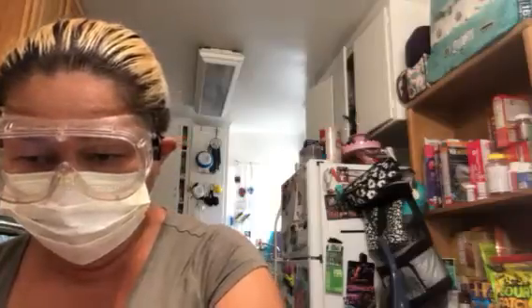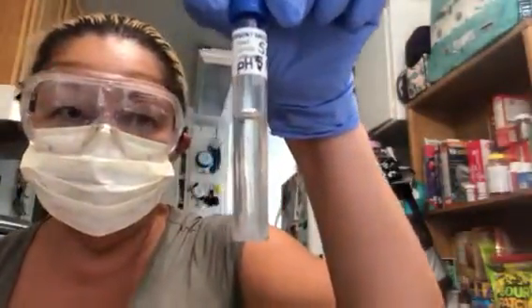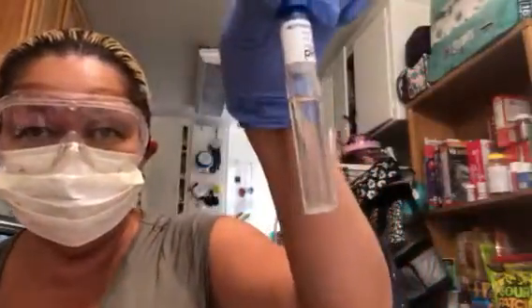I have also exercise 2, which is the salt tolerance and pH testing. So I'm going to show the result on those. I will show you the S. cerevisiae first, based on the pH. So we have a pH of 5 for the S. cerevisiae. There's a little bit of turbidity in there. It's slightly turbid. I mean, there's definitely some cloudiness in there.